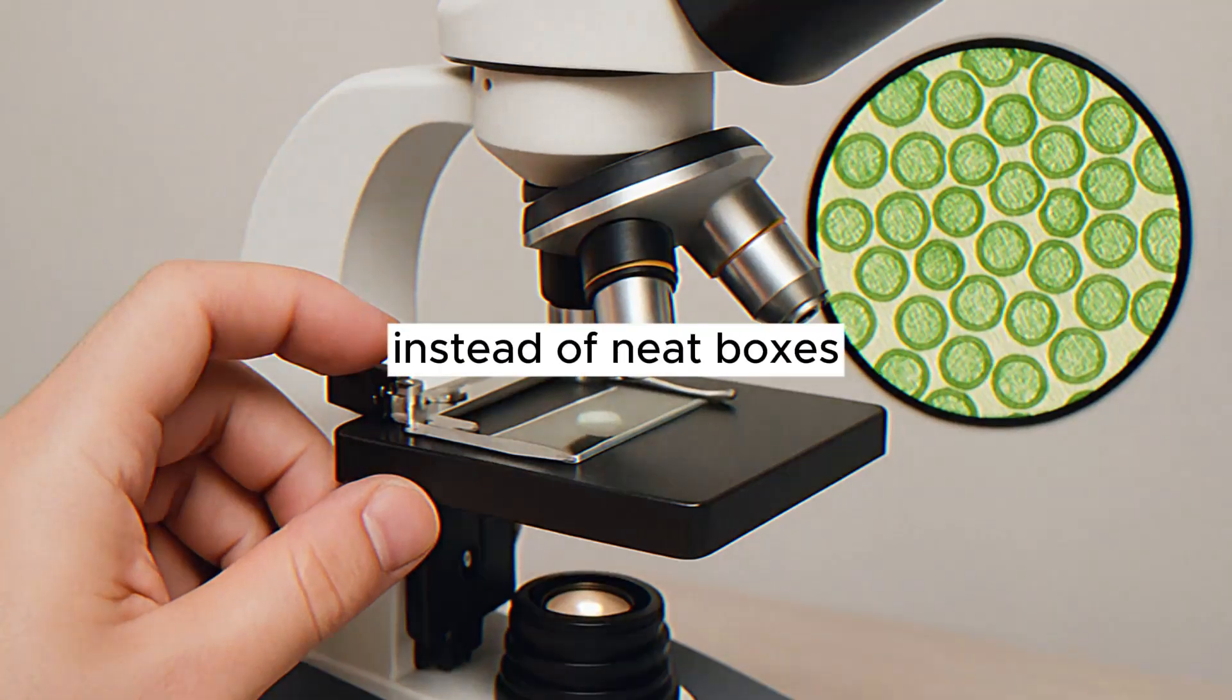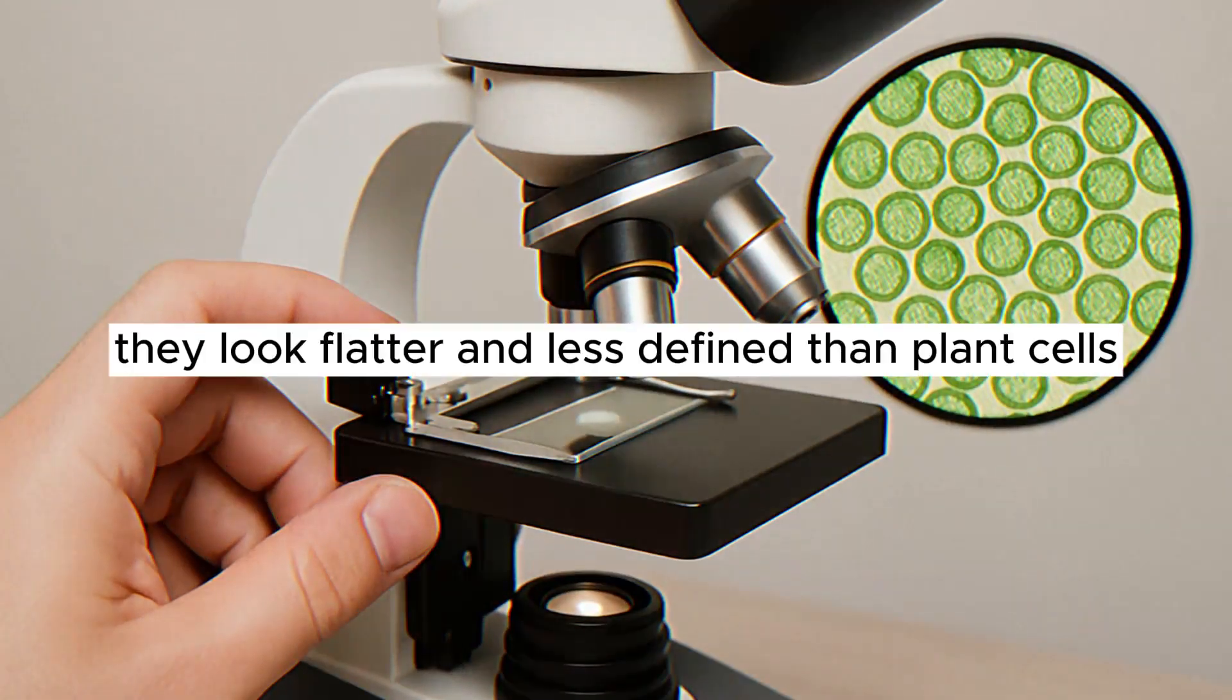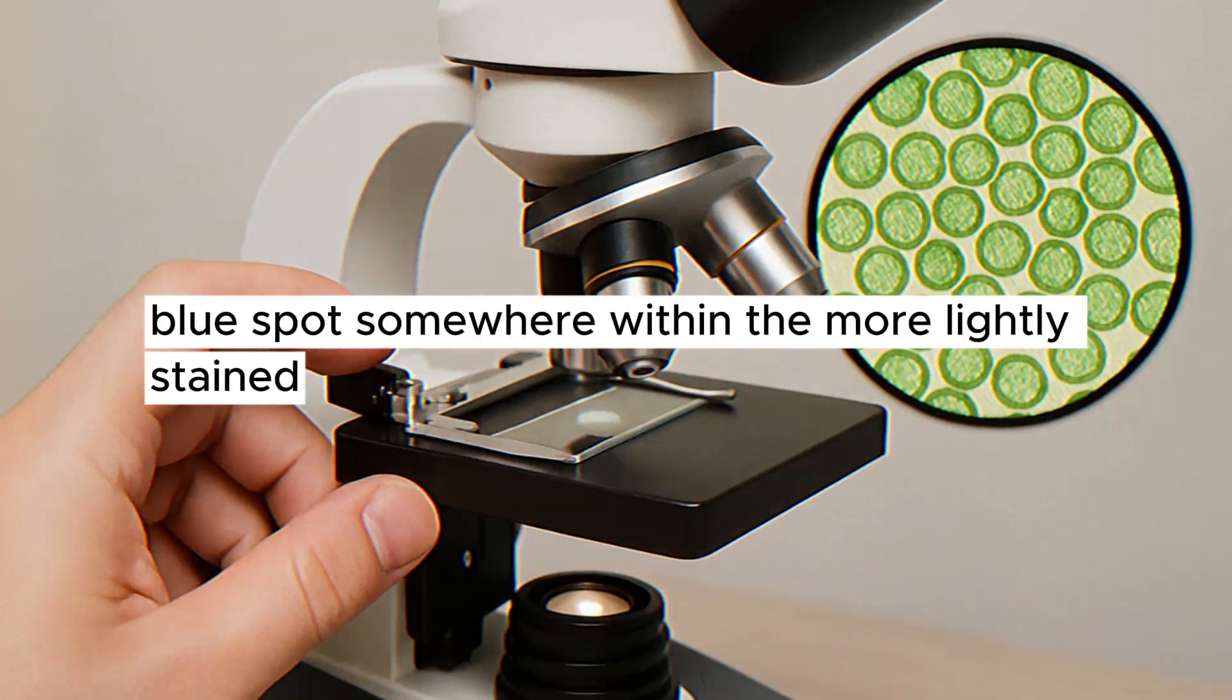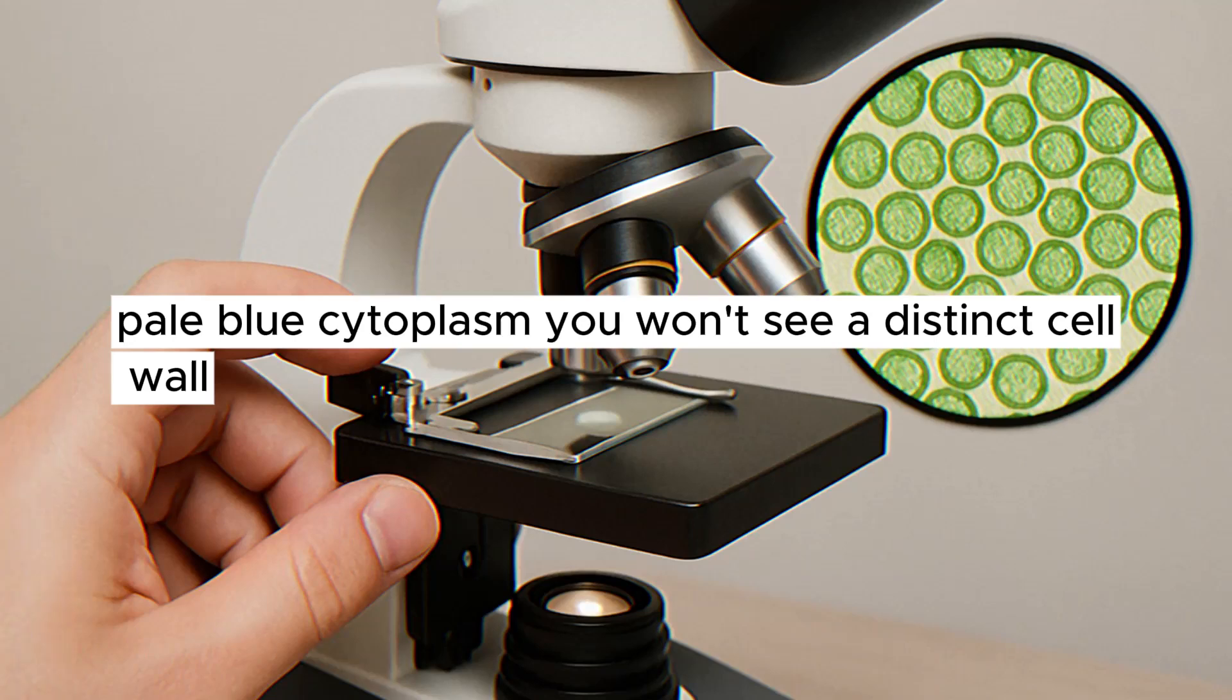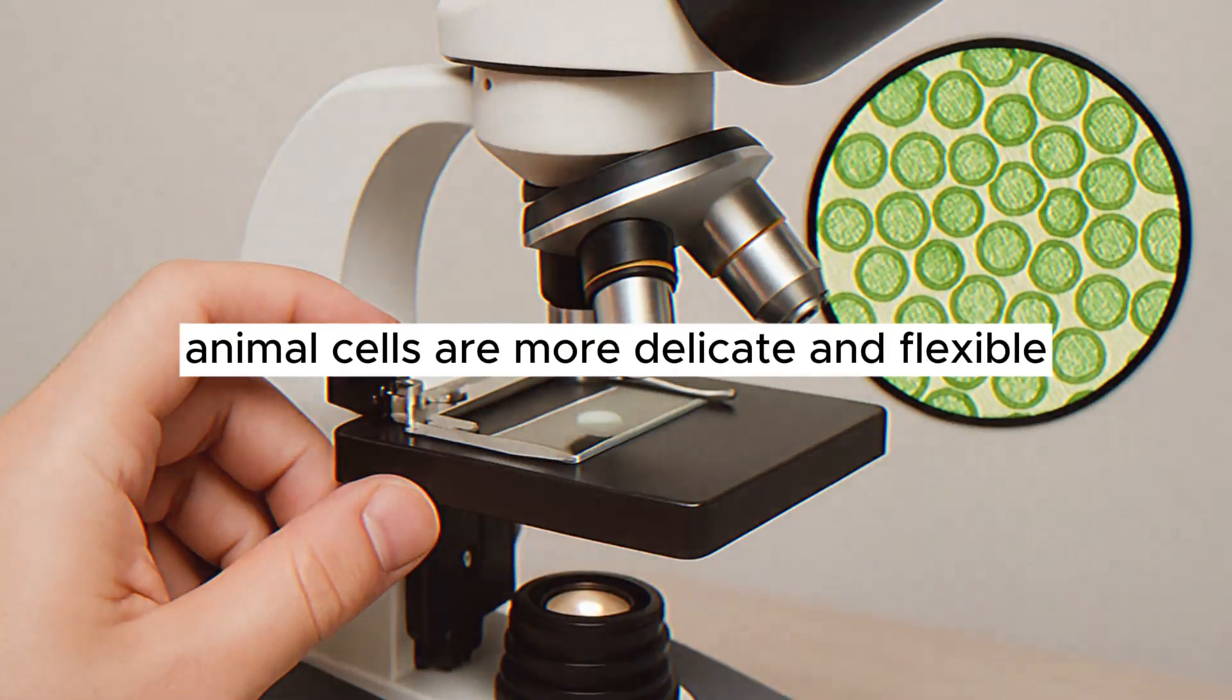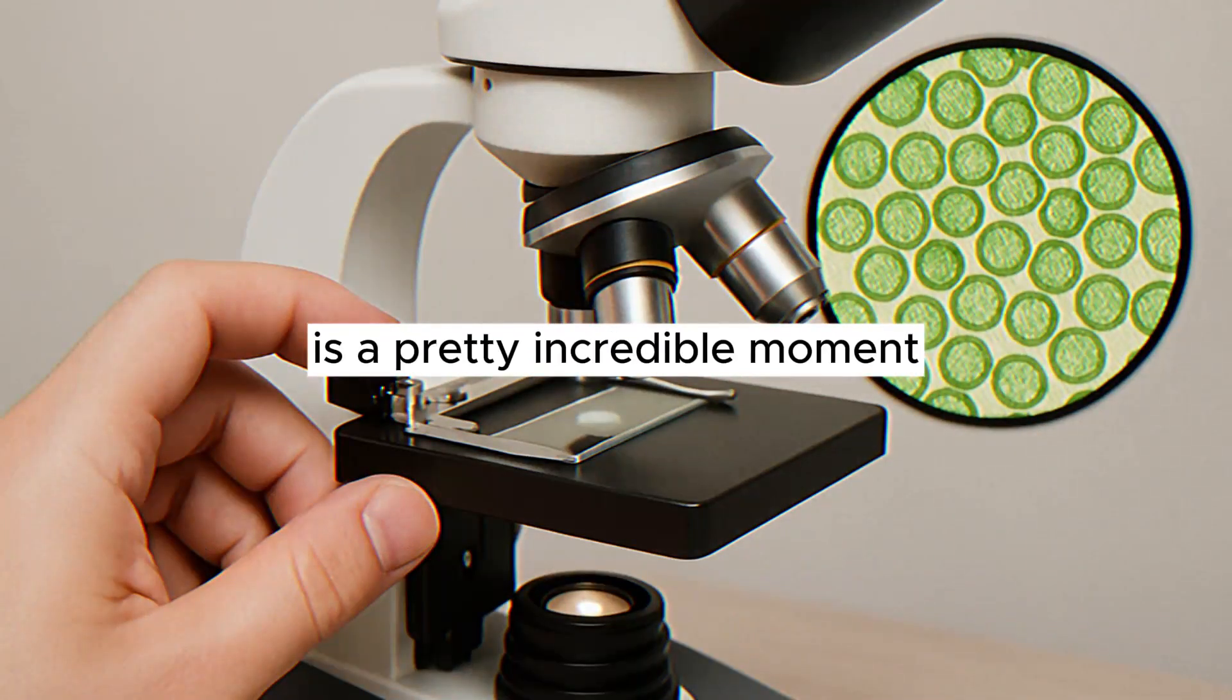Instead of neat boxes, you'll see irregular, blob-like shapes scattered about. These are your cheek cells. They look flatter and less defined than plant cells. The methylene blue stain will likely make the nucleus stand out as a dark blue spot somewhere within the more lightly stained, pale blue cytoplasm. You won't see a distinct cell wall, just the outer boundary of the cell membrane. Animal cells are more delicate and flexible, which is why they don't hold that rigid box shape. Seeing the faint outline of your own cells is a pretty incredible moment.